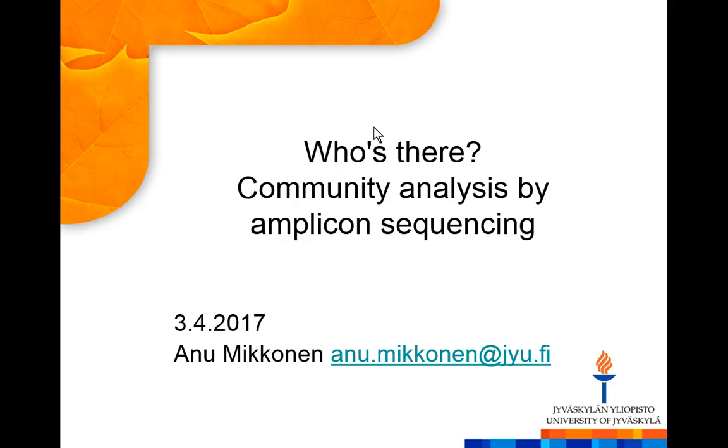I'm an environmental microbiologist, with a background very heavily in experiments in the wet lab. During the past few years, I have been working with Illumina data and with Ion Torrent data. Also partly because of my background, because of lots of experiments and lots of things that have gone wrong, I hope I will be able to give you recommendations of what to do and what not to do, how to avoid the mistakes that probably most of us make at some point.